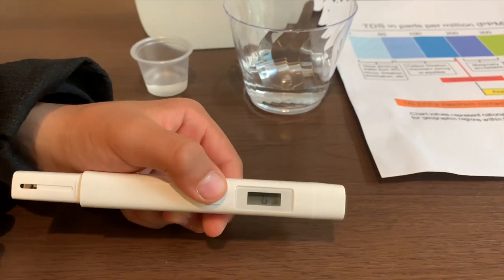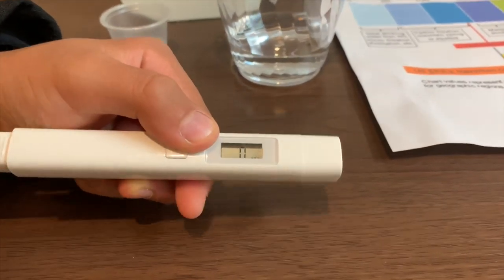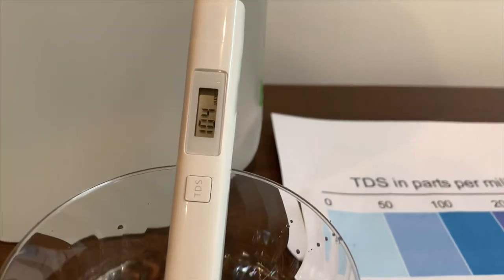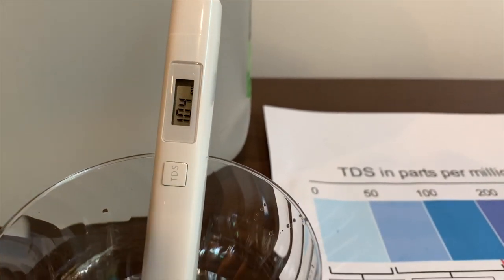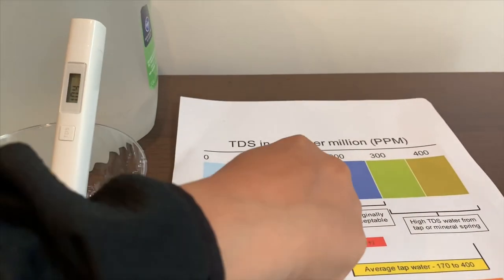Turn on the TDS tester, make sure it says zero, and put it in. One hundred and four. That is okay to drink.